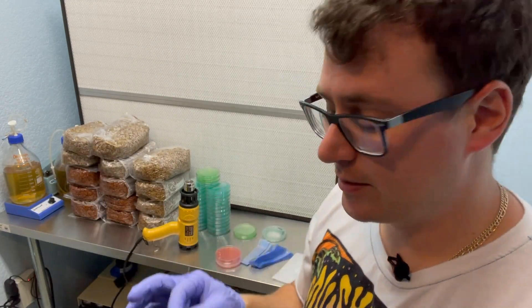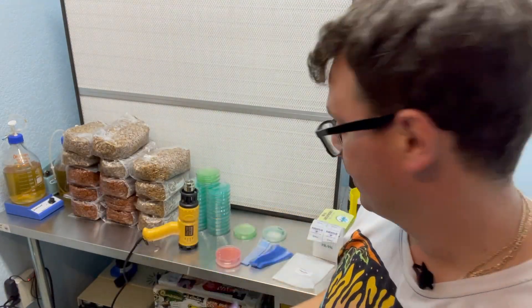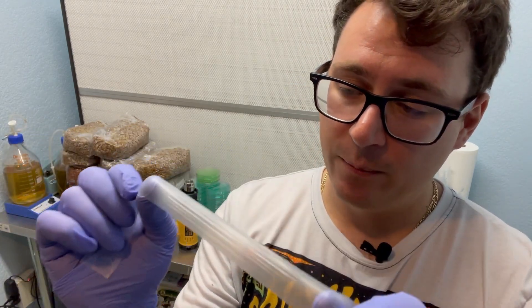Traditionally, parafilm is used instead of shrink wrap, but I thought I would explore the differences today. Parafilm is a paraffin wax — it's a stretchy substance. Shrink wrap is not stretchy at all and only shrinks when you heat it with a heat gun, whereas parafilm is not sticky but stretches out, and once it starts to stretch it goes back on itself, forming a really nice seal. There is some gas exchange with parafilm that's important for growing mycelium, so I wonder if the shrink wrap will inhibit growth in a way.